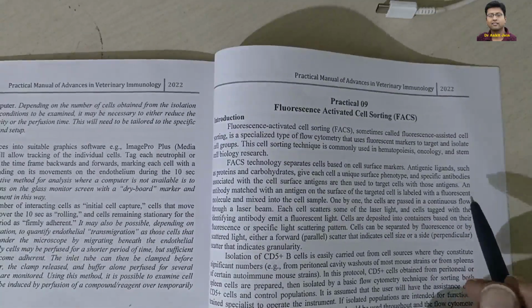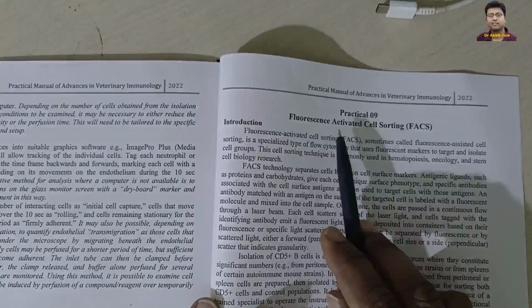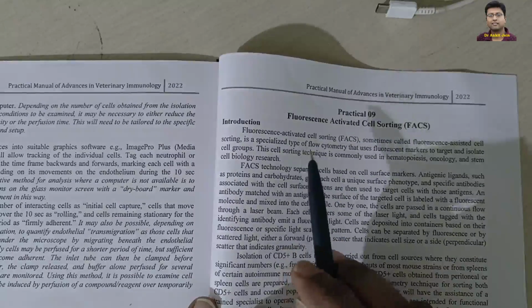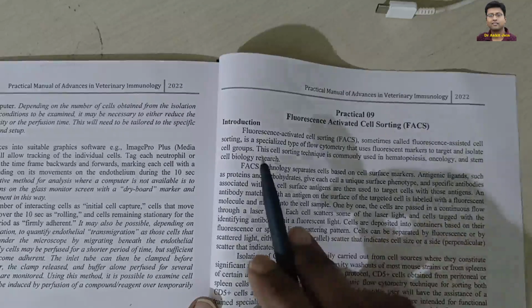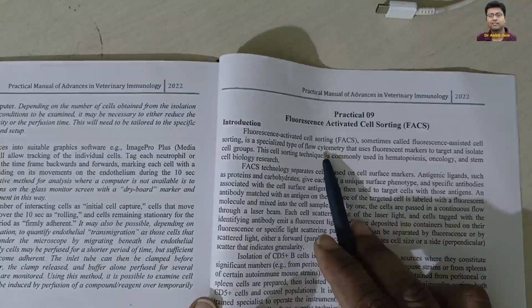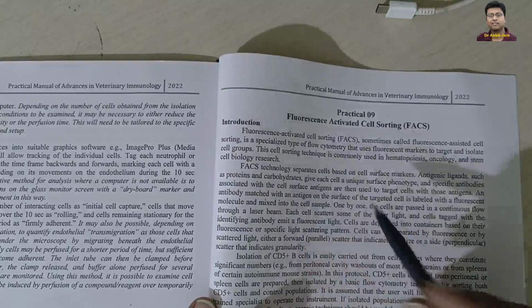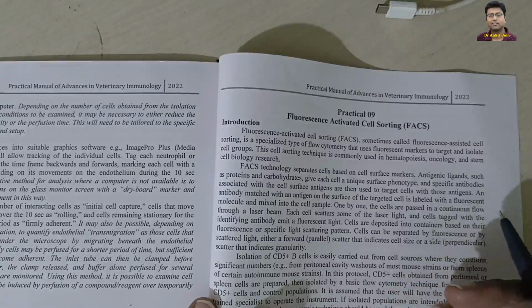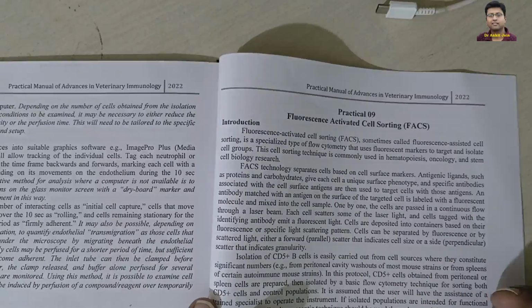Now today I'm going to cover the next topic, and it is a practical. The topic is fluorescence activated cell sorting. So friends, this is also called fluorescence assisted cell sorting, and this is one kind of flow cytometry. As we know, the purpose of flow cytometry is just to detect and sort different cells according to their size or according to their granularity.